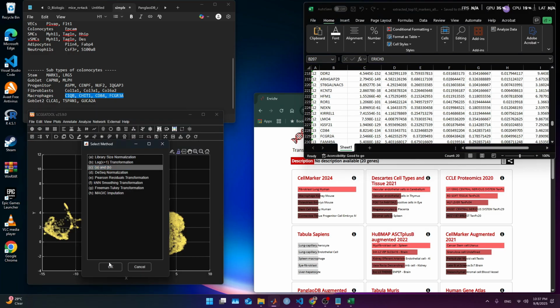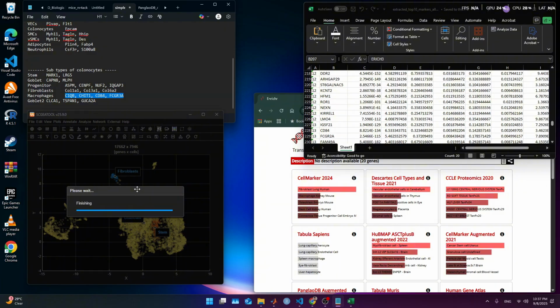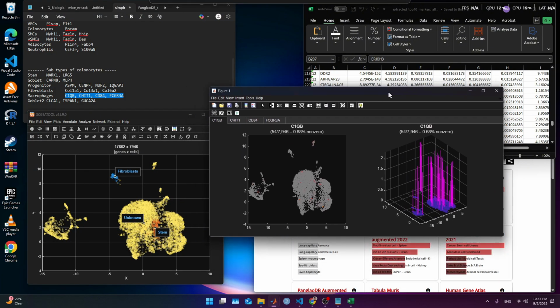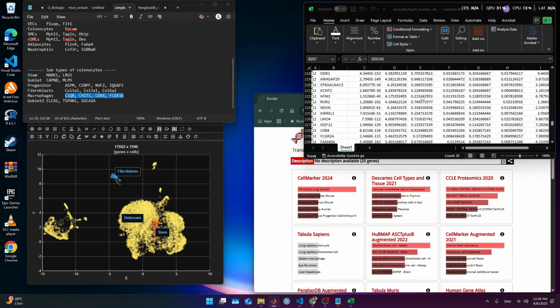Yes, A and B. And here's gonna be one cool thing as well, but I'm gonna do it in short. C1Q, it's a great marker, but it's not showing much. CHIT1, those are good markers, but it's not showing much of expression. So this is lighting up the two things, that I filter up too many cells or that it's poor quality. So it can be either.